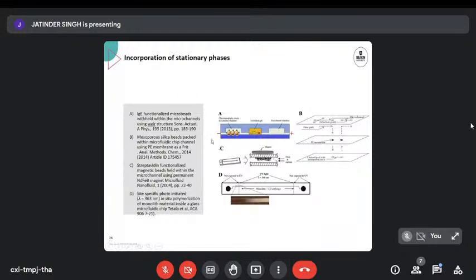Another thing that we could do is just pump a lot of reagent through, then use a magnetic bead to collect all the protein kept on the beads in place, and then move that to another area for further processing. So magnetic beads are a very useful tool if you want to hold something in place.